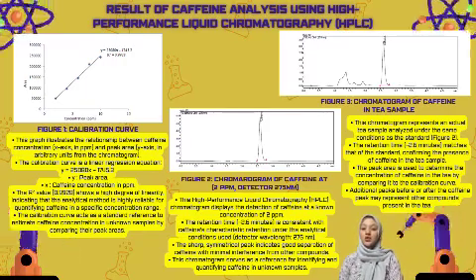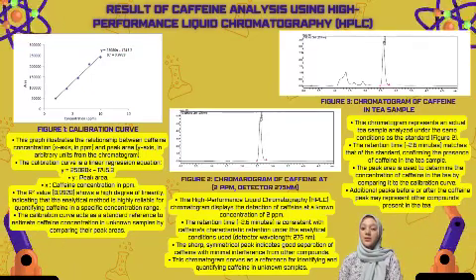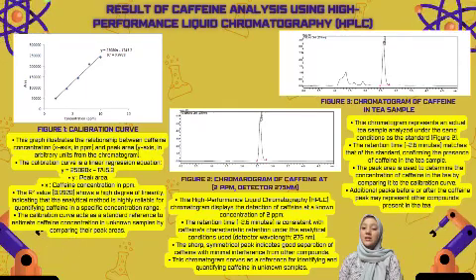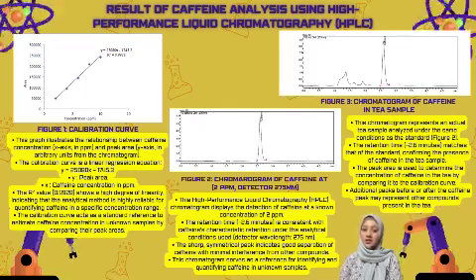Next, figure 2 shows the chromatogram of caffeine at 2 ppm. The sharp symmetrical peak at a retention time of 2.6 minutes confirms that the caffeine is well separated under these conditions.